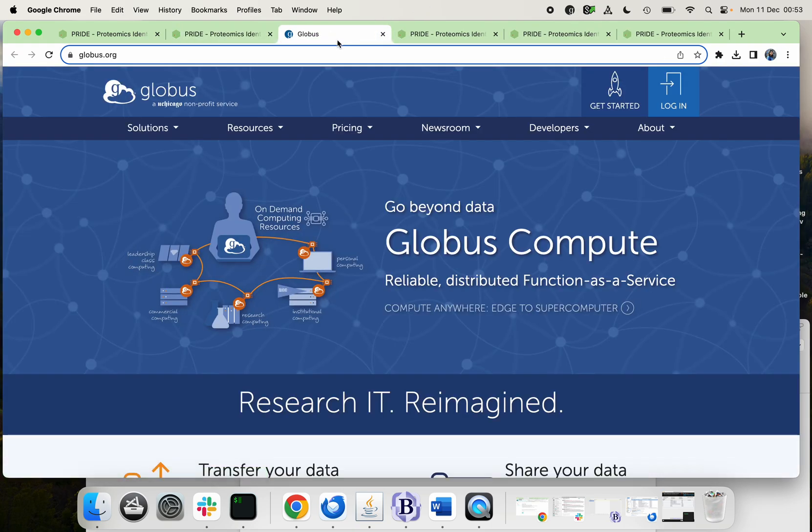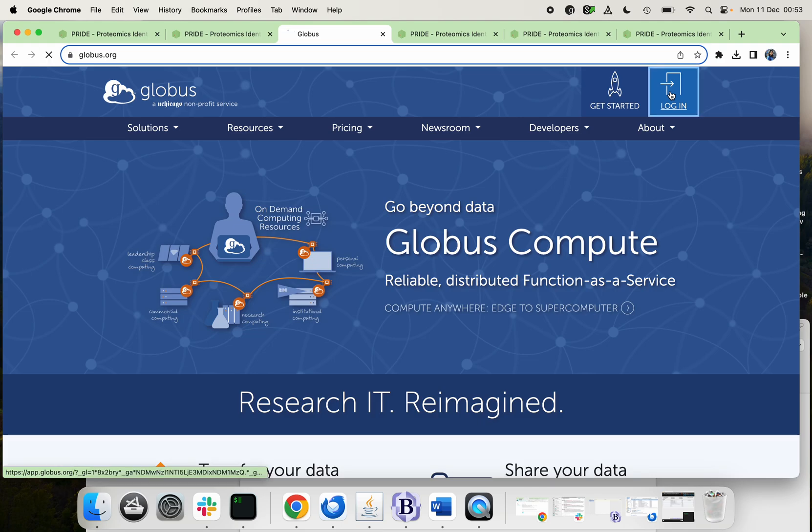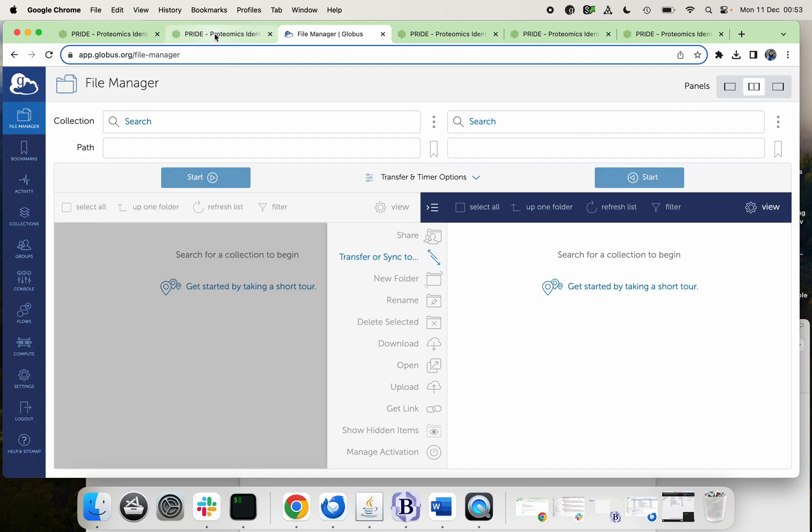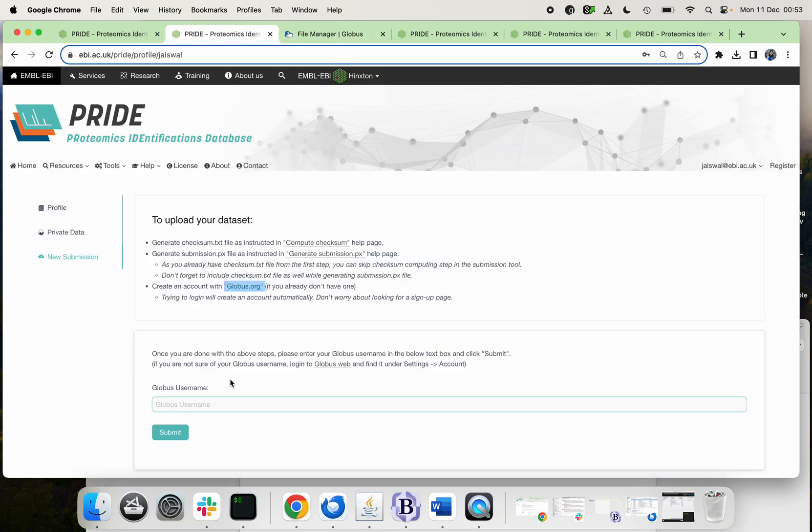You need to install Globus in your machine and you also need to create a login. After creating the login, you just keep your Globus username here and click submit.